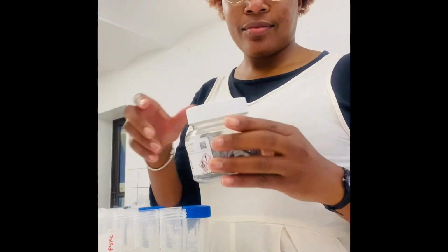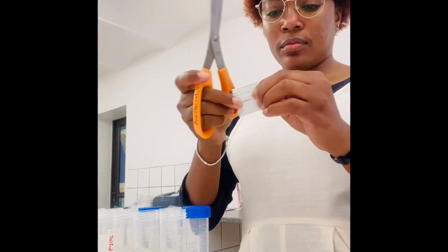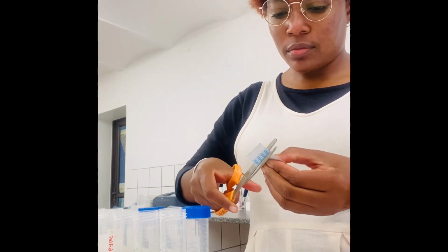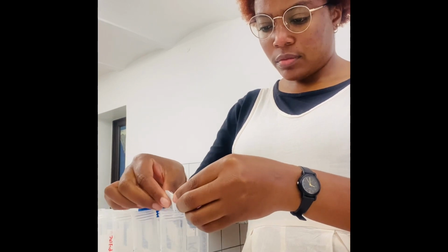Hi, welcome back, guys. So today we are going to do nutrient analysis. This is basically me in the lab analyzing for nutrients in the water, seawater basically.